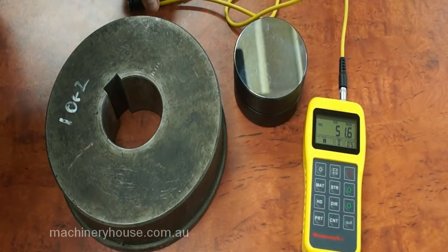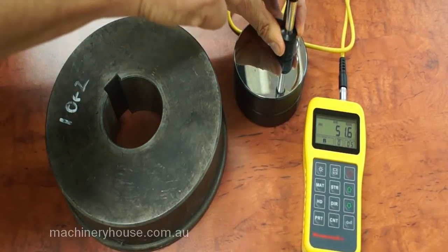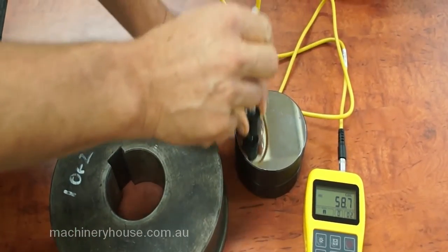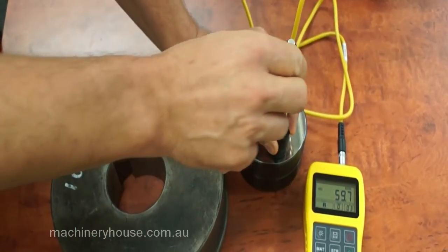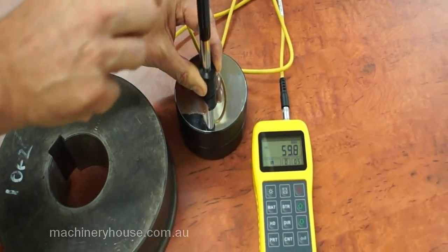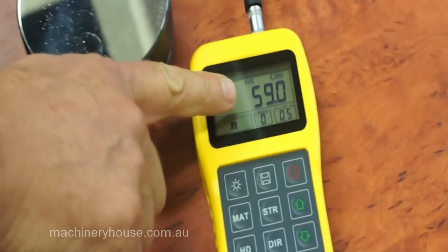I will now do a quick demonstration. Firstly, I will go to our test piece and get an average hardness of that test piece over 5 hits. You will see now the average that has come up on the screen.